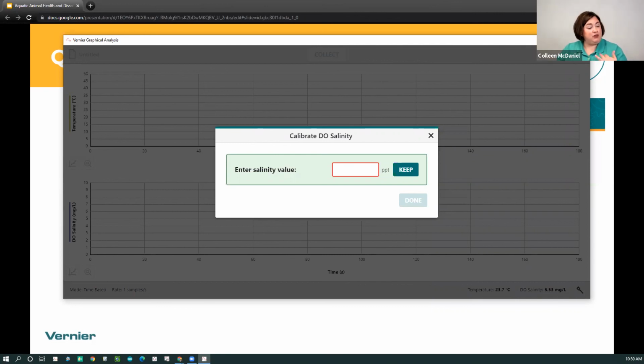Someone asked if once we put the water into the container, you do want to seal it. Basically, it's more to just make sure the water isn't flying out everywhere. It's not a matter of keeping that amount of oxygen in the container itself.